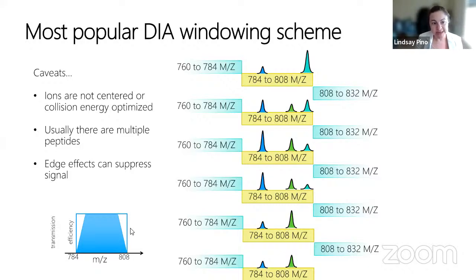Jonathan Wilson asks, are 6 to 8 precursor scans required per sample per peptide? Precursor scans aren't as important as the MS2 scans. There are some people that make their DIA methods with no precursor scans, and depending on the software you use, you don't need precursor scans at all. You can just go straight to MS2 fragmentation scans, and you want 6 to 8 of those scans so that you get 6 to 8 points across the peak in your chromatogram.